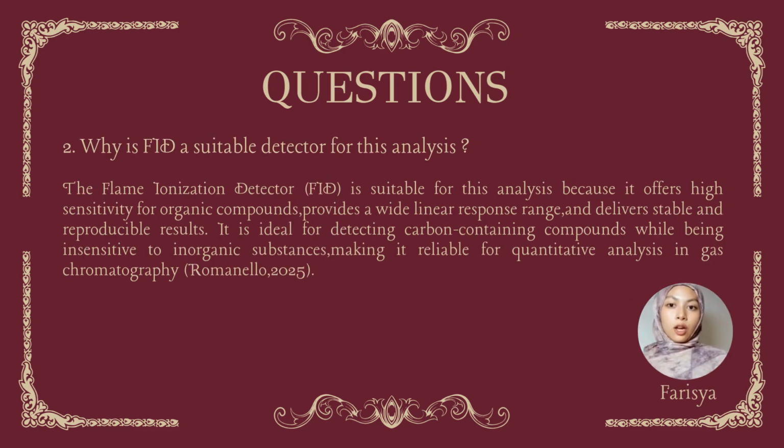For the second question, why is FID a suitable detector for this analysis? The answer is that the flame ionization detector, FID, is suitable for this analysis because it offers high sensitivity for organic compounds, provides a wide linear response range, and delivers stable and reproducible results. It is ideal for detecting carbon-containing compounds while being insensitive to inorganic substances, making it reliable for quantitative analysis in gas chromatography.